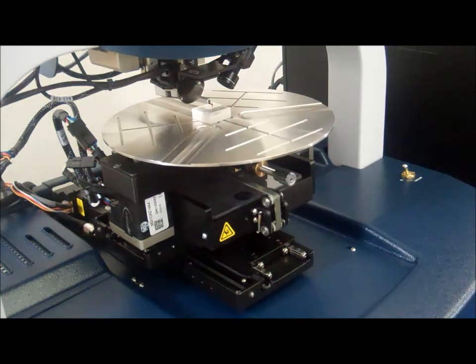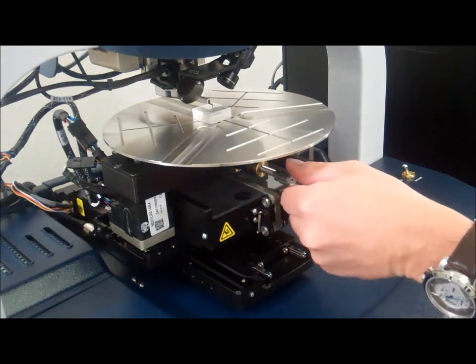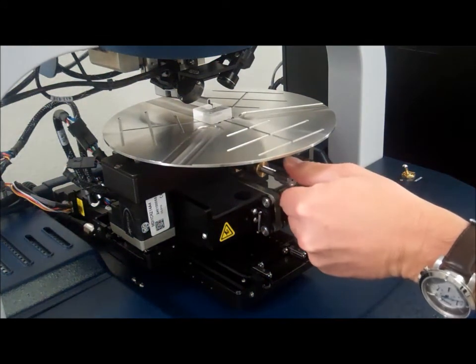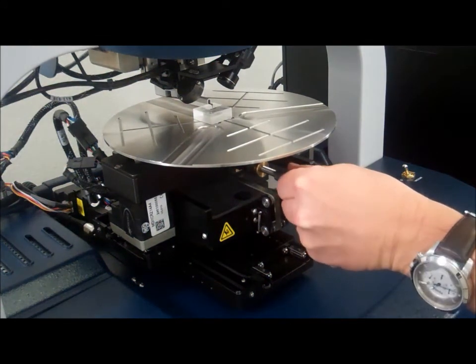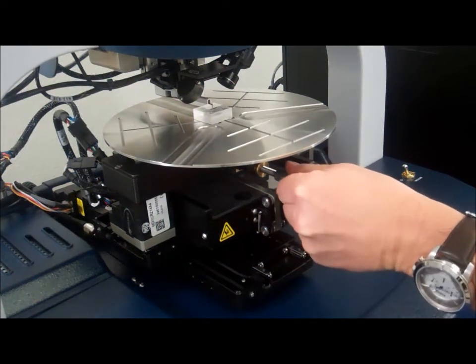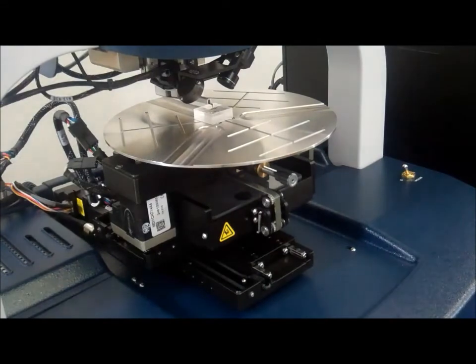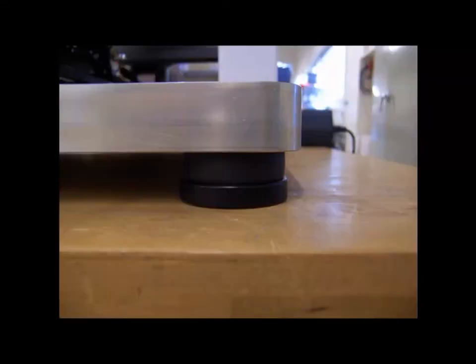Sample tilt adjustment is built into the scanning stage. This allows the operator to properly set the sample tilt relative to the sensor head and stylus assemblies.